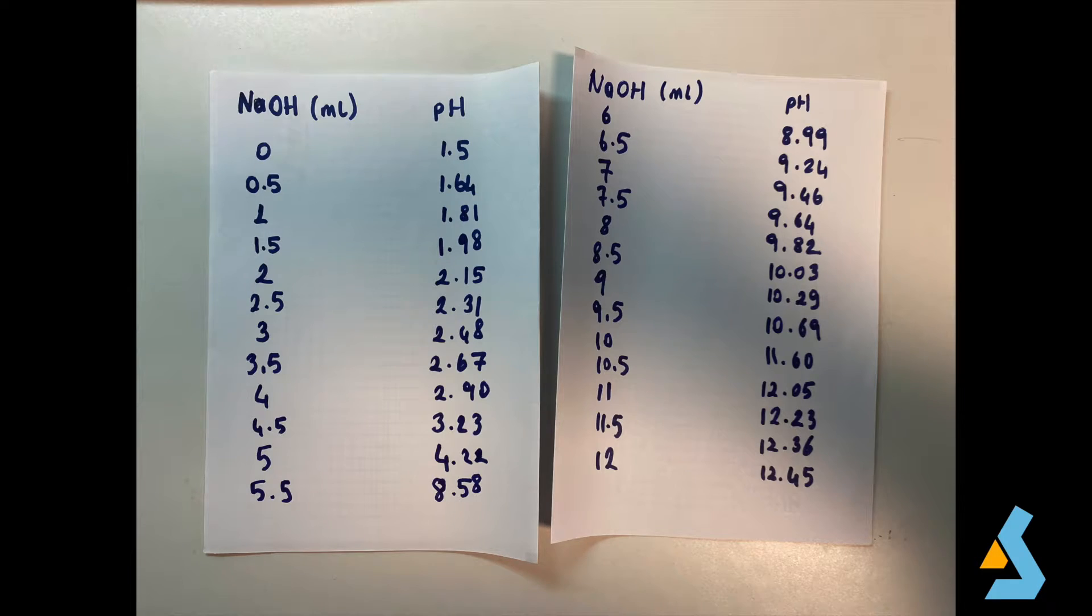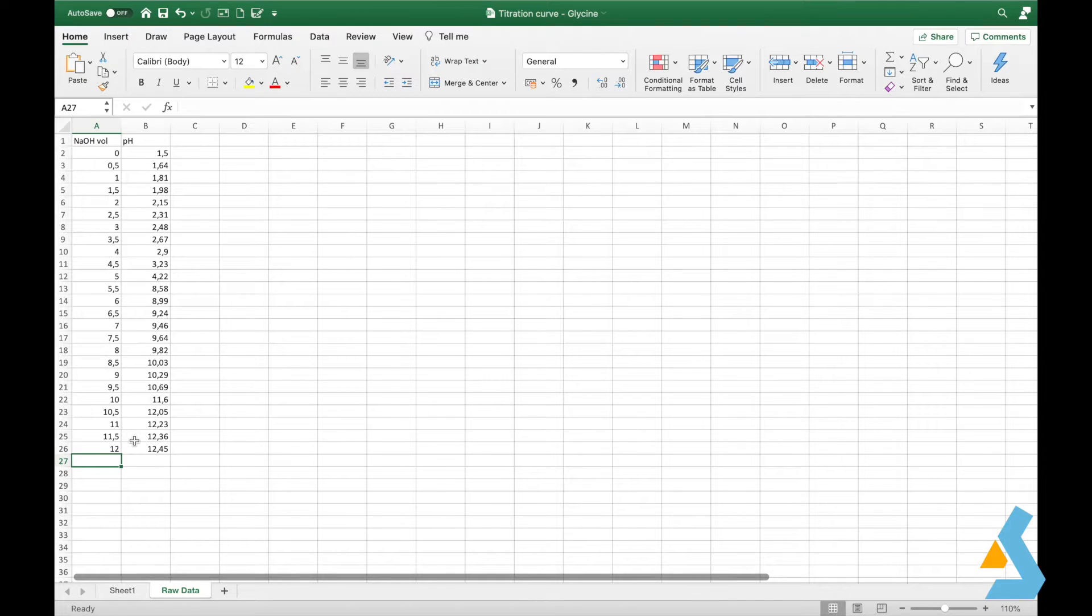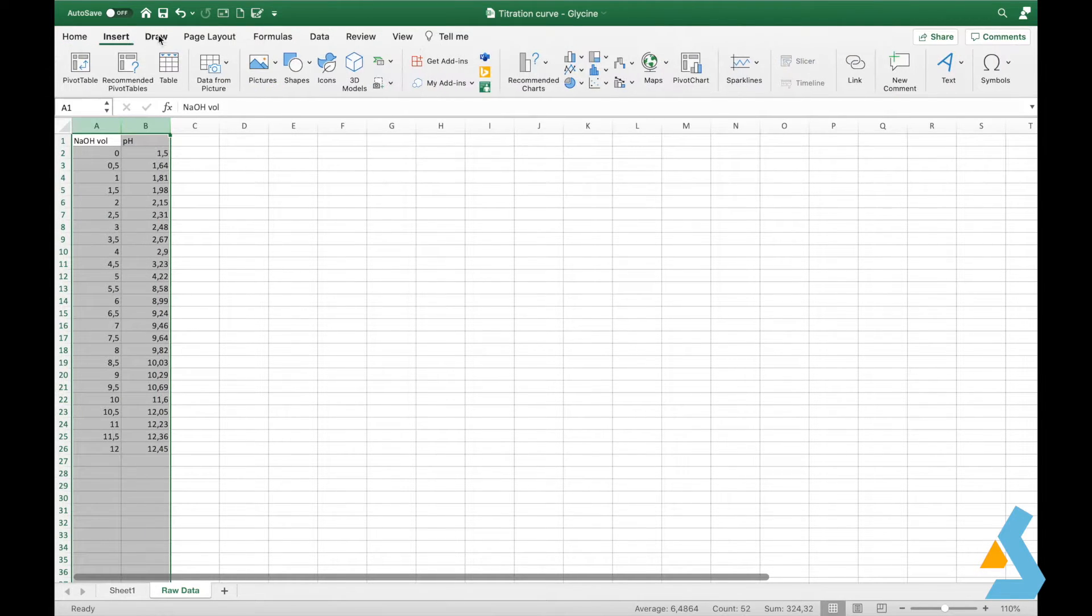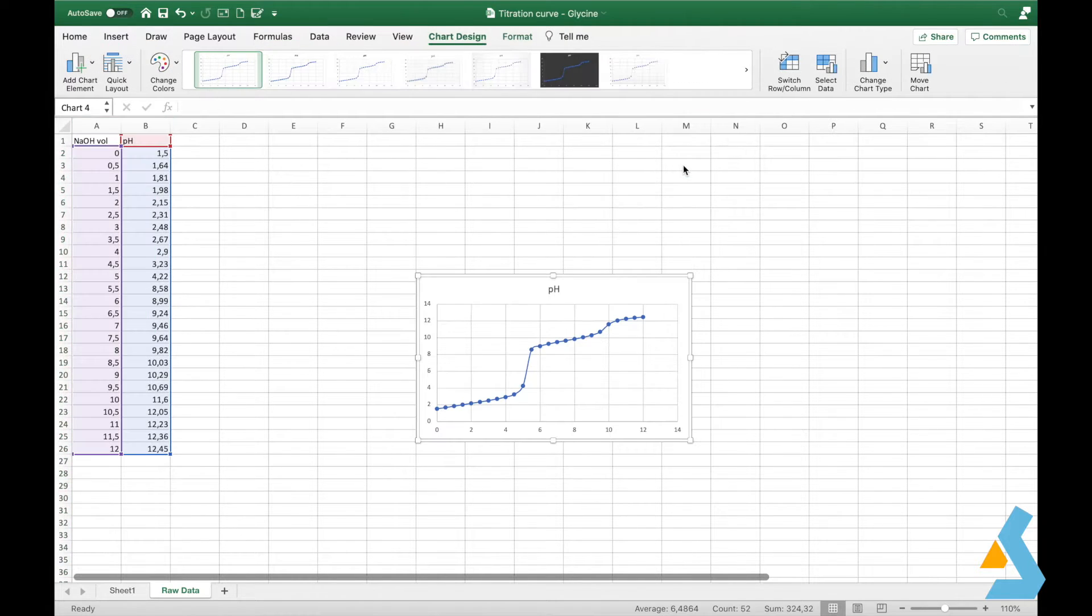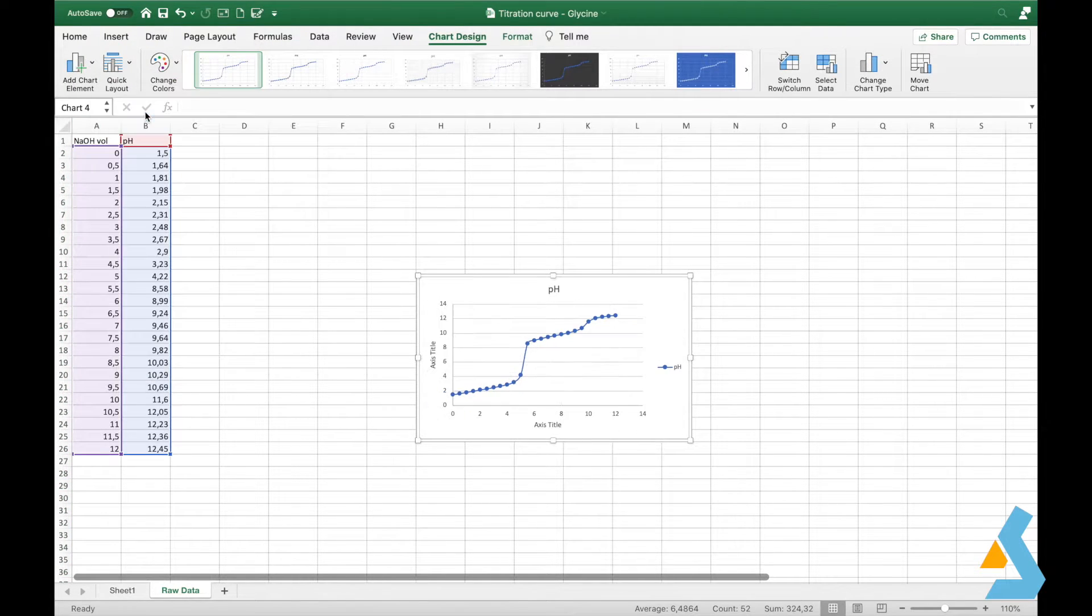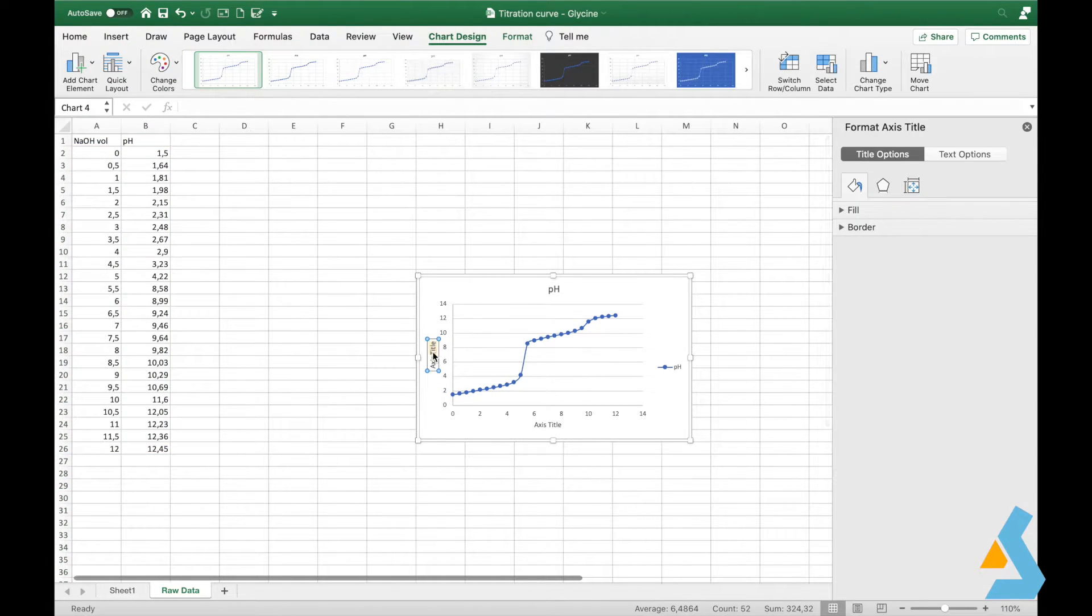We will use this measurement to plot a titration curve for glycine. The first thing you need to do is to transfer your data to an Excel sheet. We have typed in all optimized measurements. First thing we can do is to visualize what we have. To see a plot of pH with respect to sodium hydroxide additions, simply go to insert and add a scattered curve.